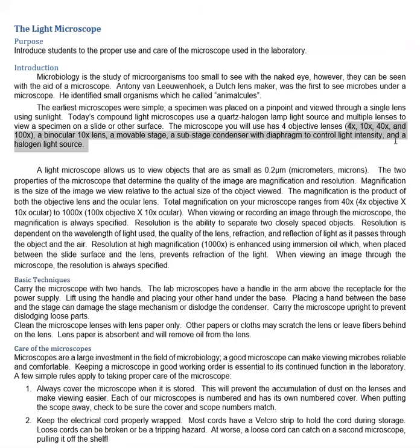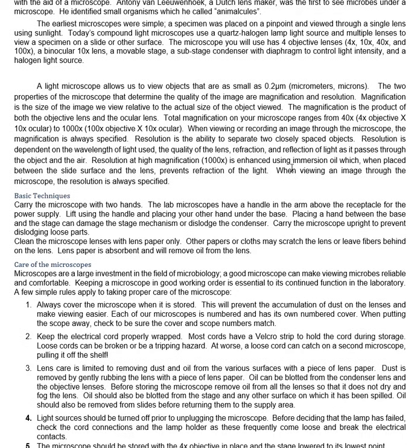You can see right here they're talking about that. We have the 4 objective lenses and the binocular or the eyepiece. We've got a movable stage. We'll talk more about this when we get to the picture, okay?